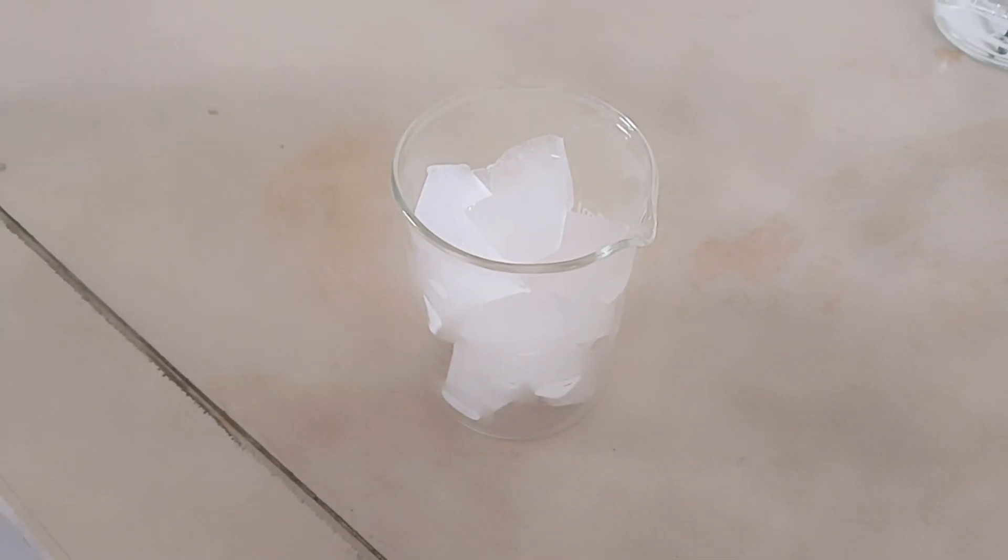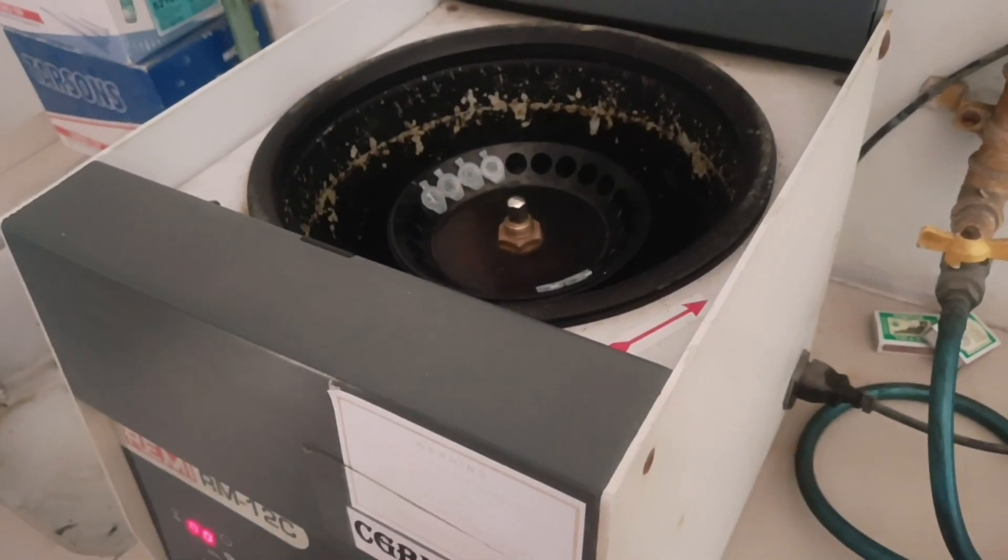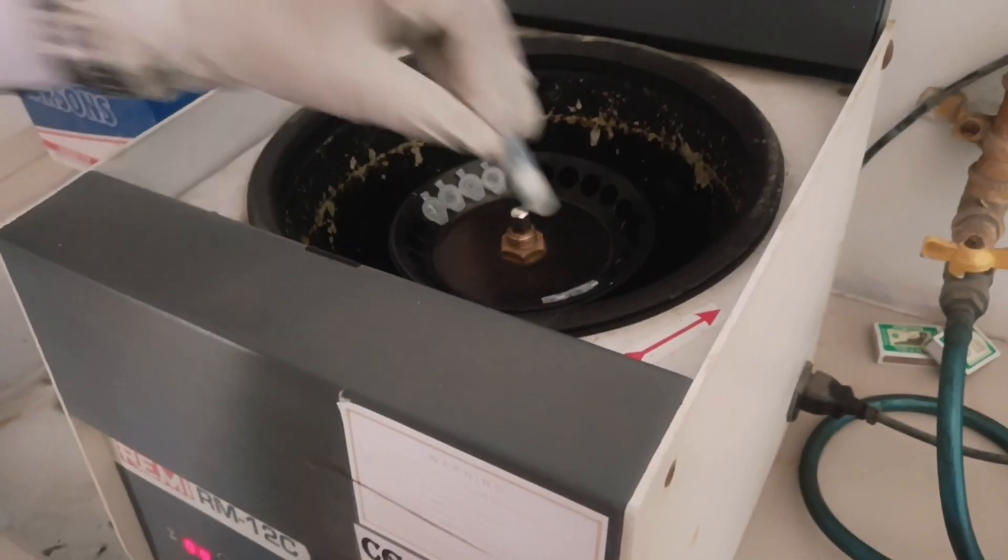Keep all the tubes on ice for 15 to 20 minutes. Centrifuge all the tubes at 10,000 rpm for 10 minutes.